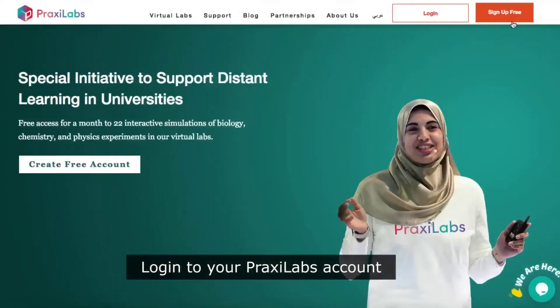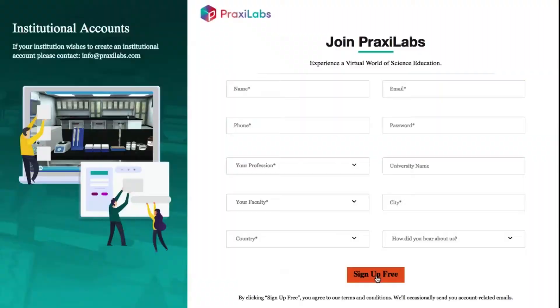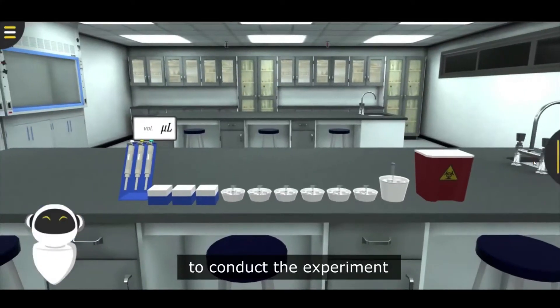Log in to your Praxylabs account using your username and password, and then go to the lab to conduct the experiment.